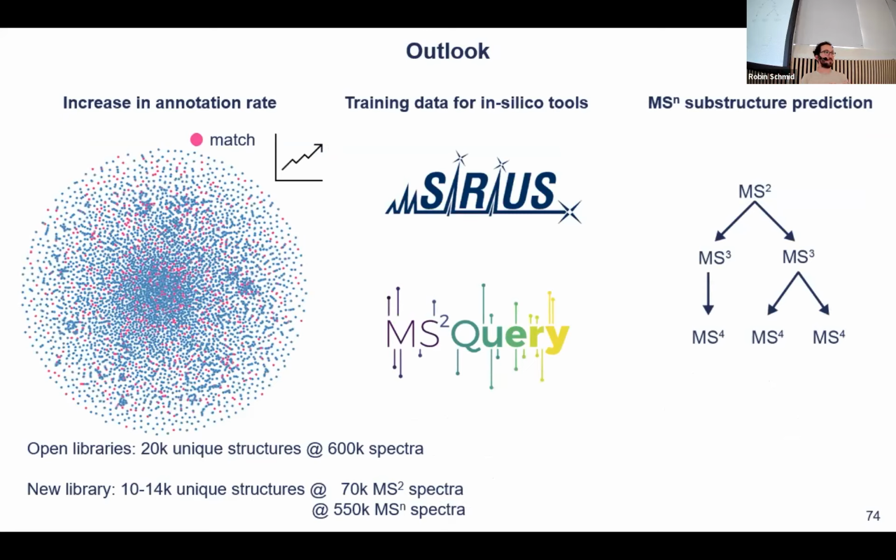Yeah, so on GNPS, there might be some spectra that are still profile mode, or where the metadata does not match up. A lot of things like that happen because we made it very easy. It's not that people don't want to share, but it needs to be easy and comprehensible, because you shouldn't need a PhD degree to just push data somewhere, right? So really, we hope that this makes it very easy.